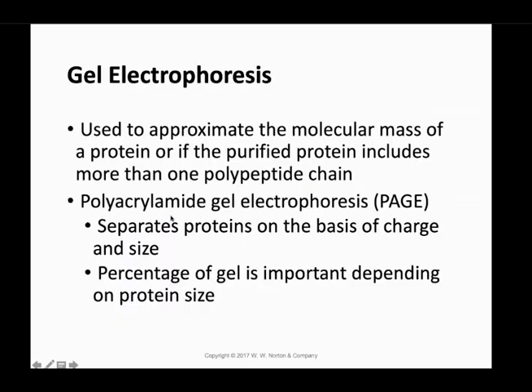And this is where we have another method, which is gel electrophoresis. This is basically a gel, right? Where you can actually separate the proteins. You will use in this case polyacrylamide gel, which is basically like a jello where you can separate proteins. Remember when we were studying nucleic acid, how to separate DNA, RNA, you use agarose gel. And this is just because the size of that specific gel in nucleic acid are bigger than protein. So it depends on the size. In this case, for protein, we use polyacrylamide gel electrophoresis.